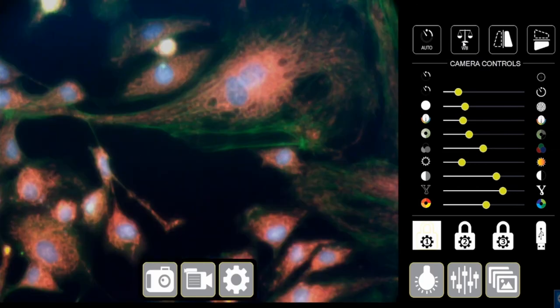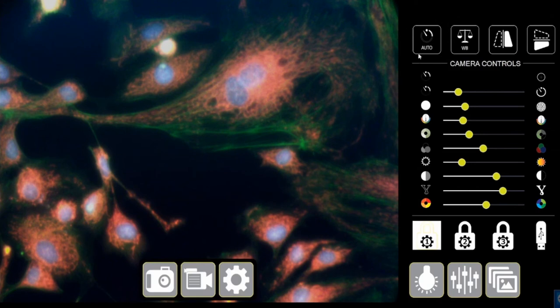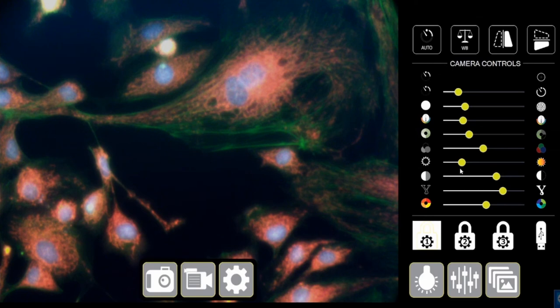This is your auto button. This comes in handy when you're just new to fluorescence, starting out, you hit auto. This automatically goes back to default setting, which is optimally set for the camera and for most samples under RGB.